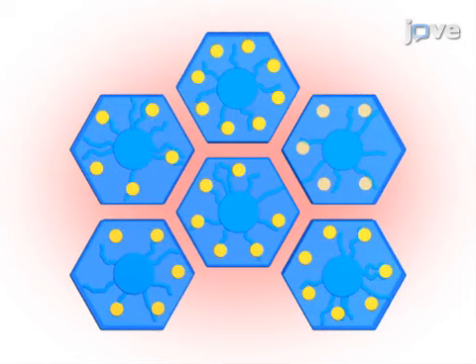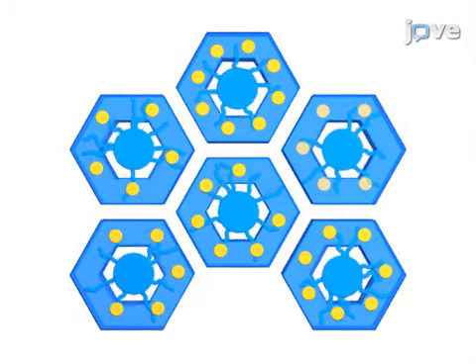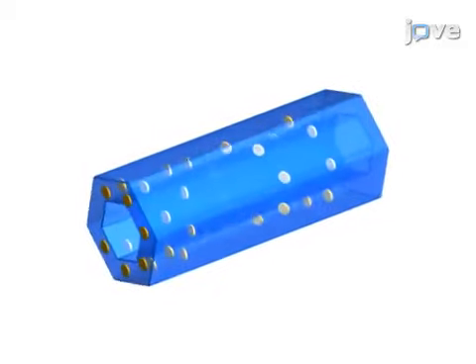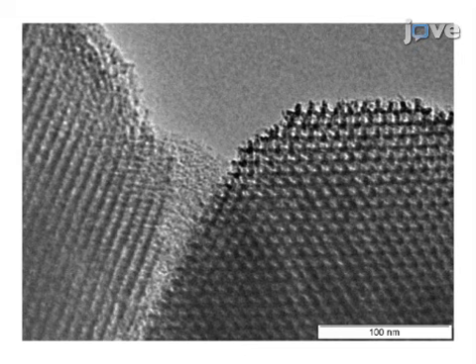During the hydrothermal processing treatment, silica is polymerized to form its mesoporous structure, and gold precursor starts to grow at the nanoscale. The final step is to calcine the material to remove any remaining surfactant and obtain a well-defined mesoporous structure. Ultimately, physisorption, X-ray diffraction, and transmission electron microscopy are used to show that gold nanoparticles are intercalated into the well-defined walls of the mesoporous silica.